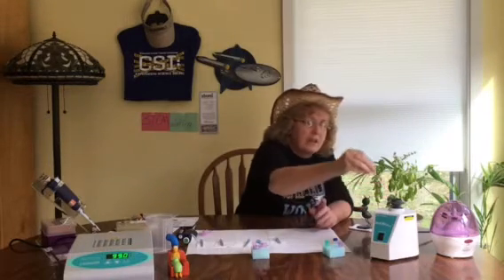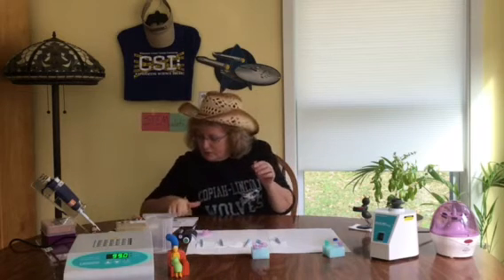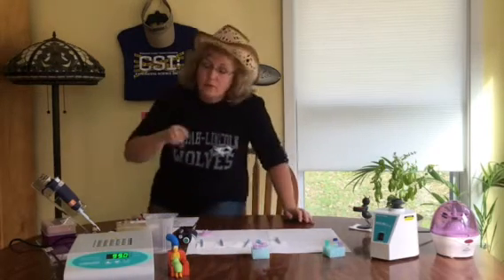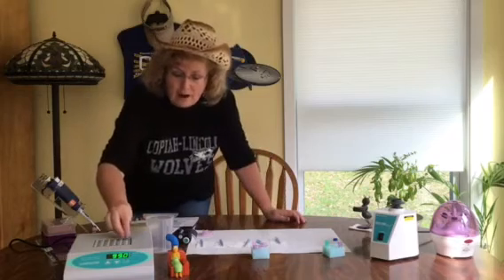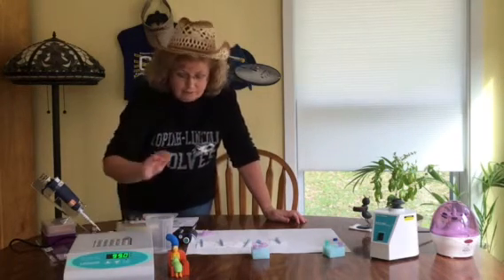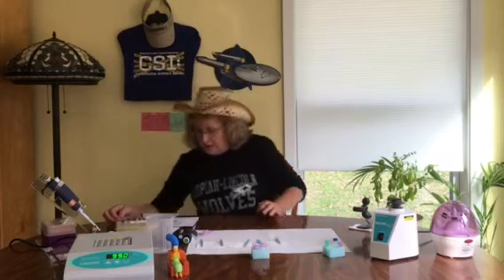After 30 seconds, you can take your tube, making sure that you follow your protocol, because I don't want to do anything wrong for the video. Vortex samples for 30 seconds, and then place them in a water bath or dry bath. We happen to have a dry bath. Notice that it is now up to 99 degrees. You can definitely feel the heat. How long does it need to be in the dry bath? For 10 minutes.